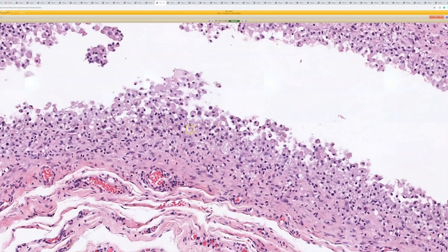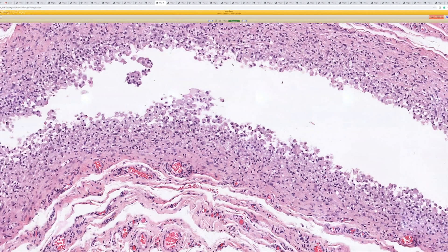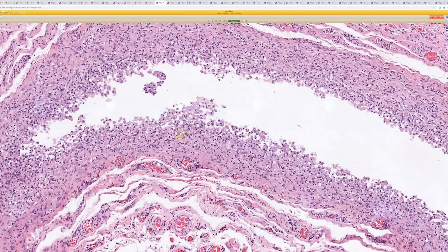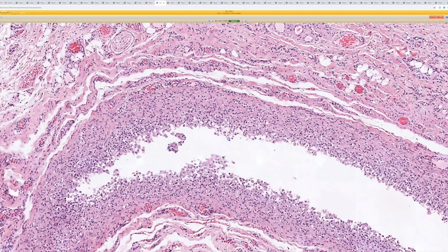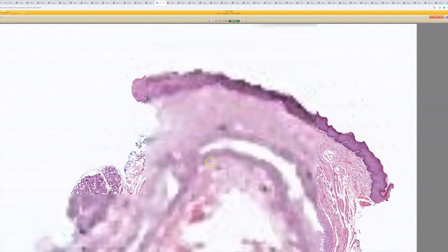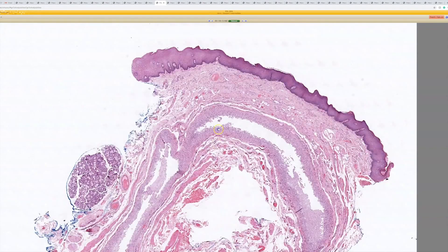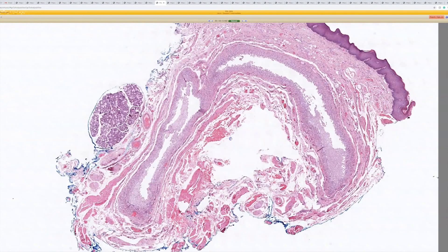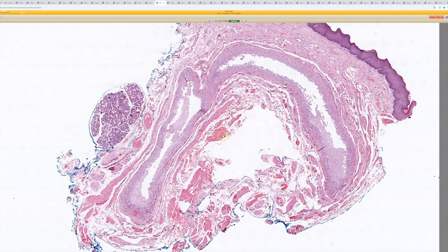It's kind of like how we had the keratin granuloma earlier from a ruptured keratin-filled structure — this is what happens when you rupture a mucus-filled ductal structure in the oral mucosa. So this is a mucocele. Very nice.